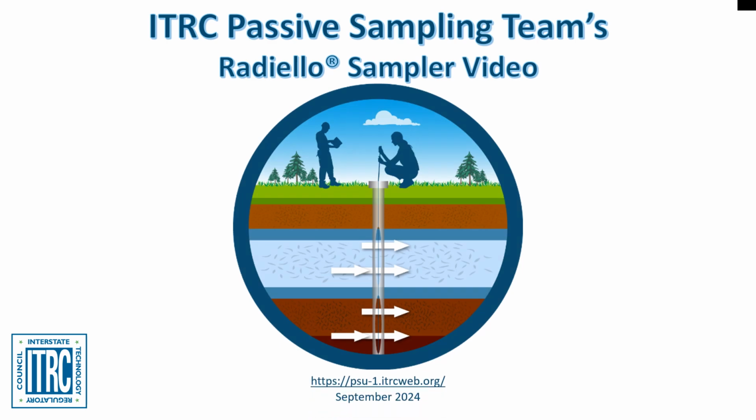Welcome. The Passive Sampling Technology Update team is proud to present an overview of the Radiello sampler technology. This quick video will provide a high-level overview of the device, as well as instructions on how to use, deploy, and retrieve the device. For more information on this and other passive sampling technologies, please visit the Passive Sampling Technology Update Guidance document.